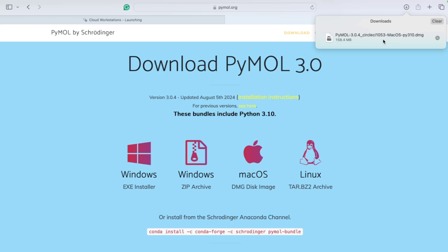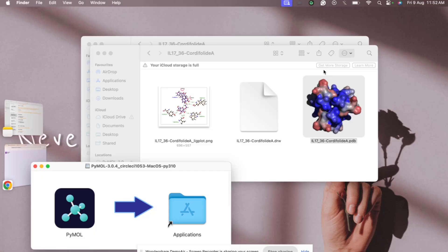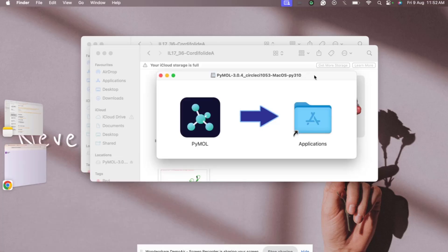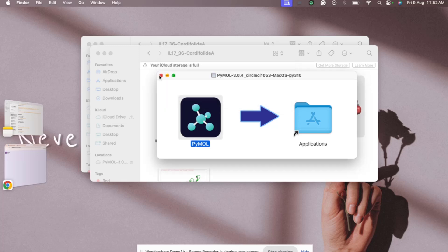The file will be downloaded as a .dmg disk image file, because Mac supports .dmg files. If you double-click on it, you can drag and drop it to the Applications folder. However, since I already have it installed, it gives a warning asking whether to replace or keep both. I'll stop here just for demonstration.